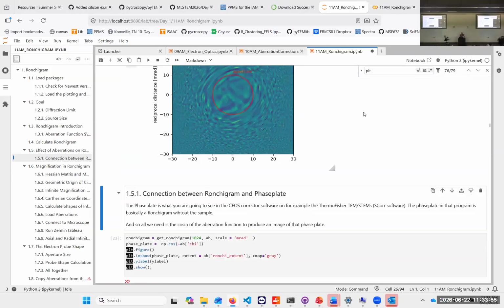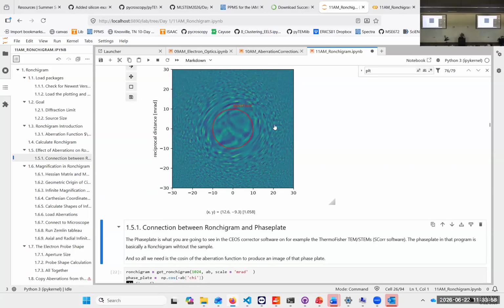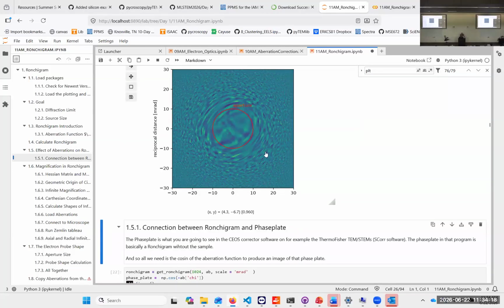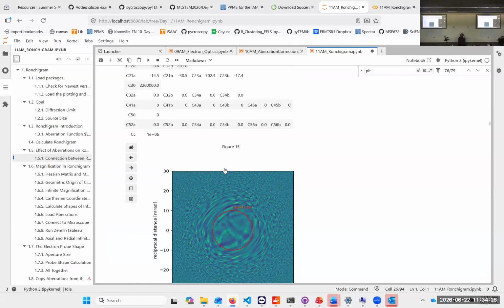And most of them are directly related to your scan direction. So that's part of the job of the alignment from the company that you get the microscope from. Only in very unlucky cases do you have a 180 degrees change here.